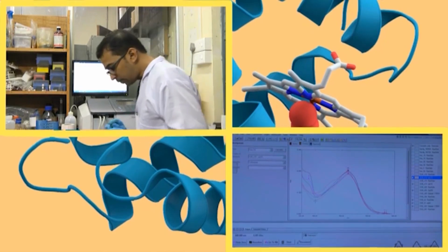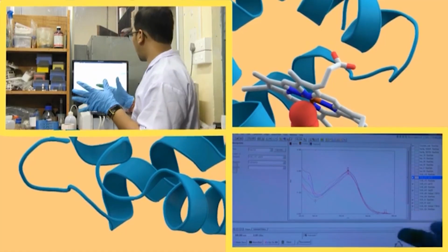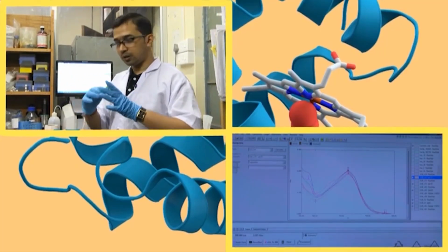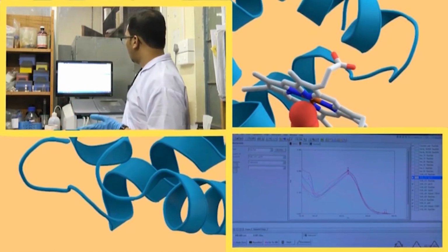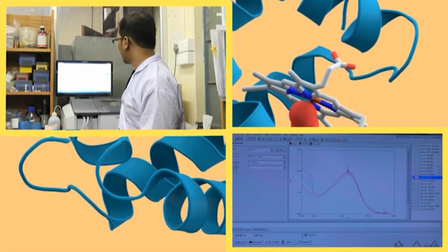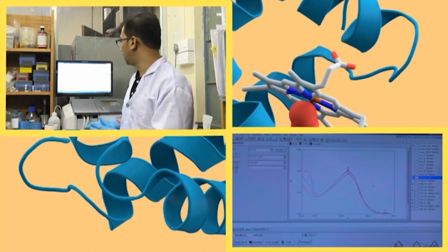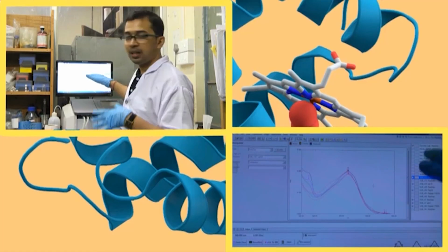So, for taking this delta absorbance value, delta A value, which region are we actually interested in? We are interested in that region where the decrease or the change in the absorbance values is quite smooth. In all the cases, this particular 400 nanometer region should be ideal, but as we all know, there might be some manual error while doing the experiment, whereas in the next experiment, if you proceed, it shows a gradual decrease.